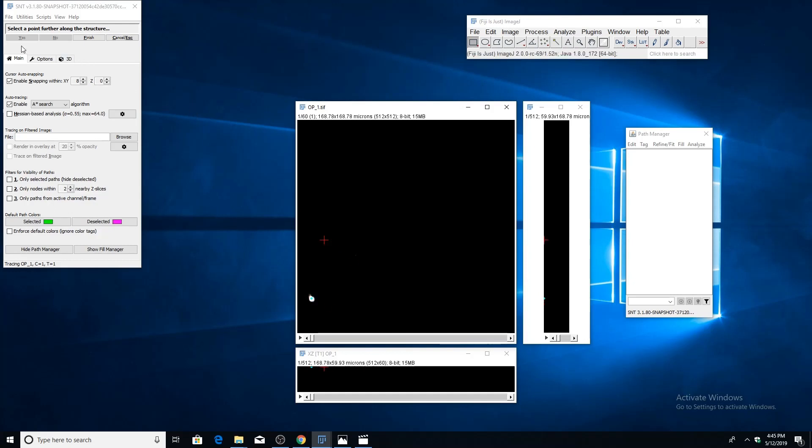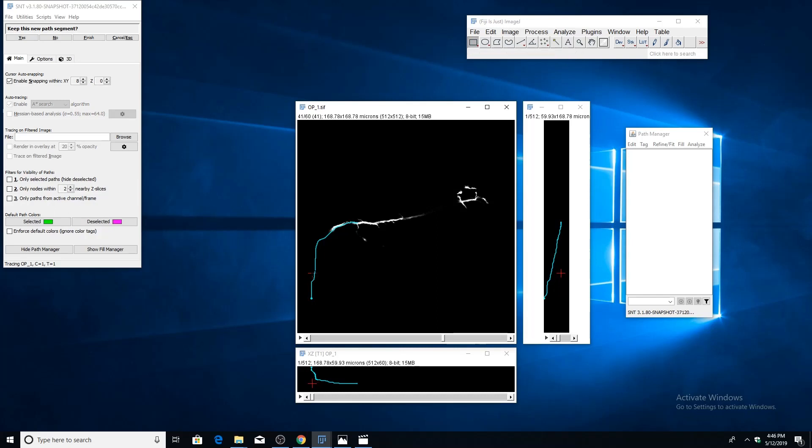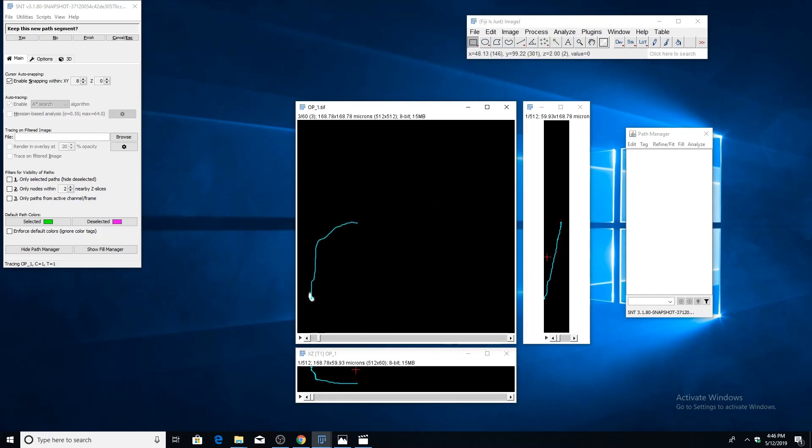You'll see that a little circle has been created indicating the start point of a new path. If you look back up here, it's asking us to select a point further along the structure. Let's find where we want to place our second point. If you click, you'll see that the A-star algorithm has found a path between those two points, and you can just scroll along it and see if it looks correct to you.